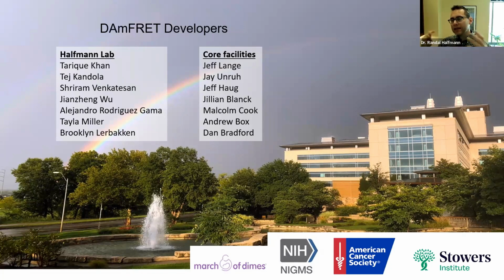Once you lyse the cell, all the protein that was previously confined to individual cells is now exposed to every other molecule. Unless your state is really stable, it's all going to end up in the amyloid, and you're going to lose that species. Certainly, there are ways to try to get there, but I think it's going to be challenging.